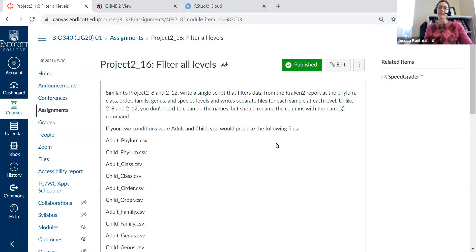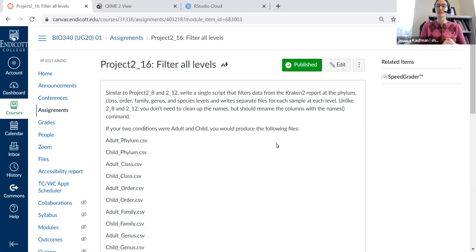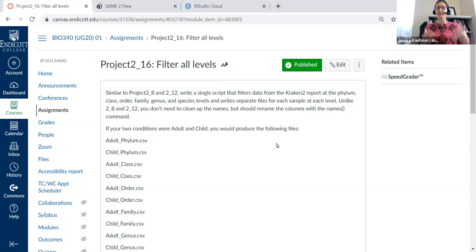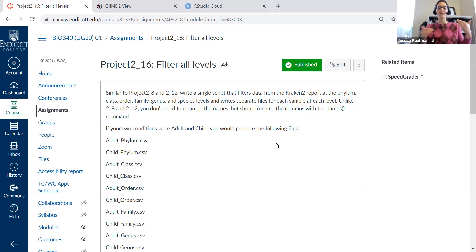Hi everyone! I want to give you a little bit of extra guidance for project 2_16. In this assignment I'm asking you to take our tabular files from Galaxy and turn them into separate small files for every level of taxonomic classification.